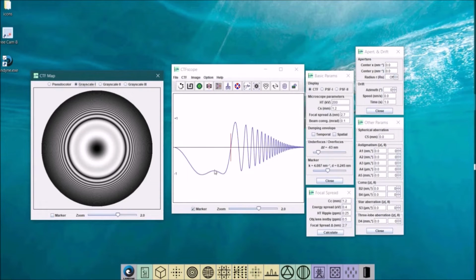The 2D colors can have the marks too, but only when these 2 values here, the zoom values here, are the same value.